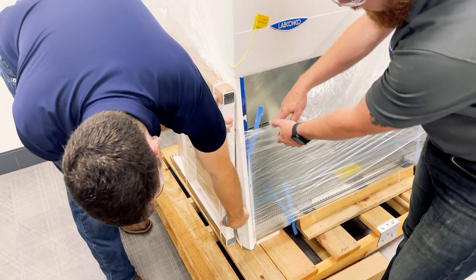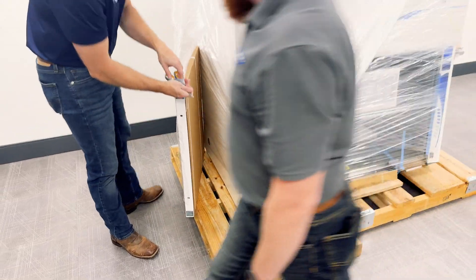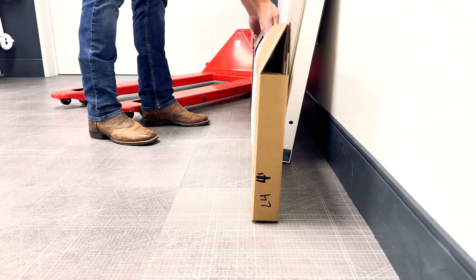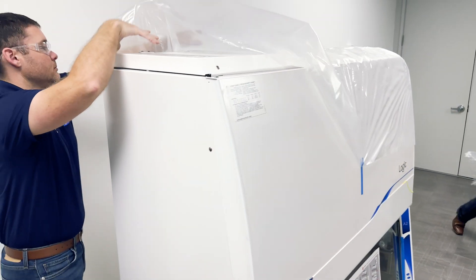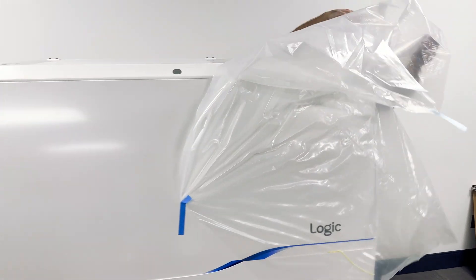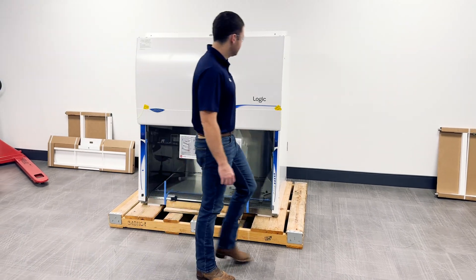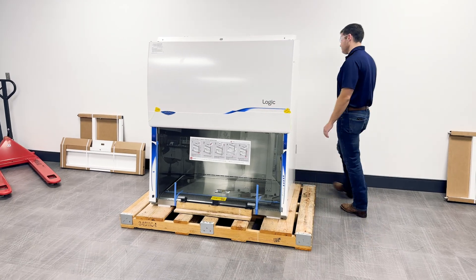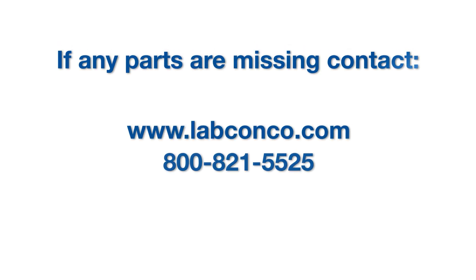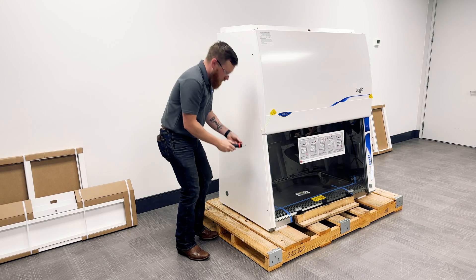If the biosafety cabinet includes a base plate, place it aside in a safe place until later. Once unboxed, inspect the BSC for any shipping damage. If any damage occurred, contact the freight carrier that delivered the BSC to file a claim.